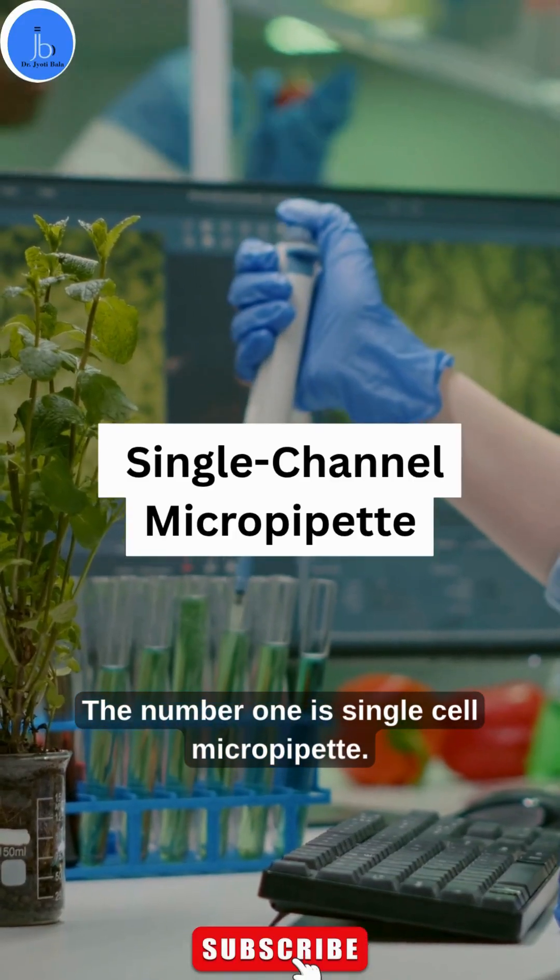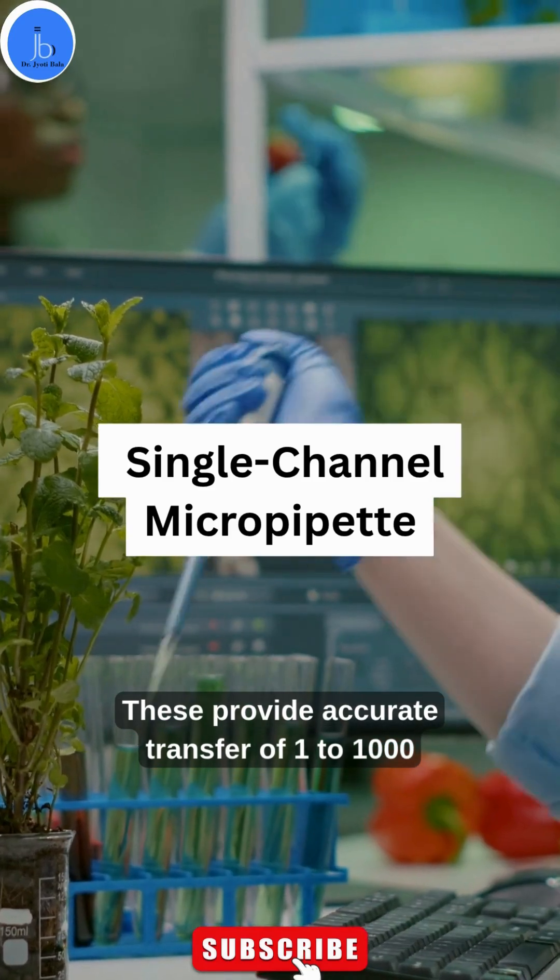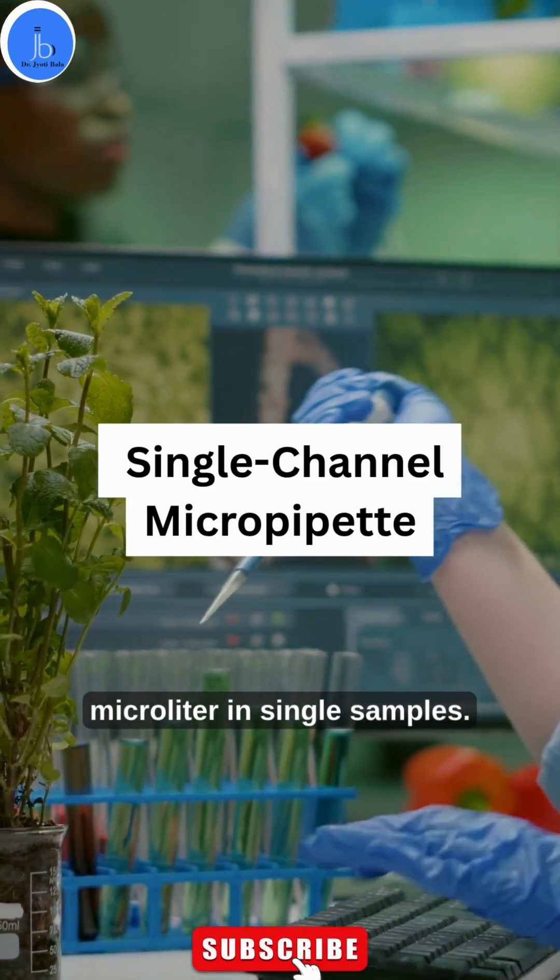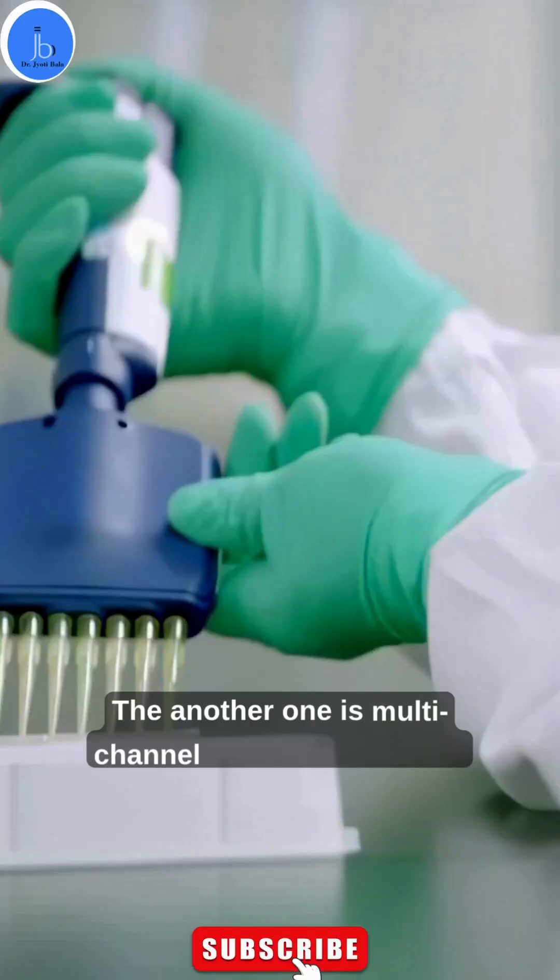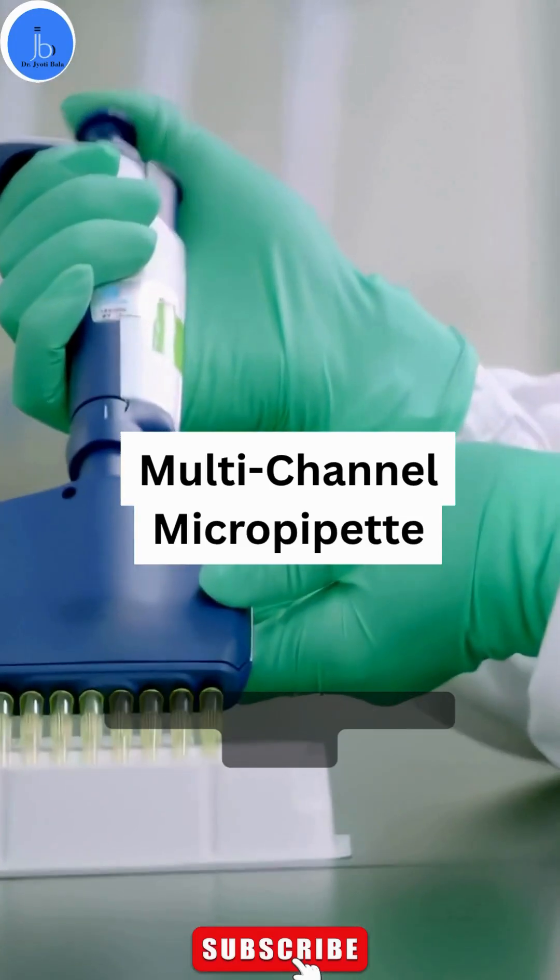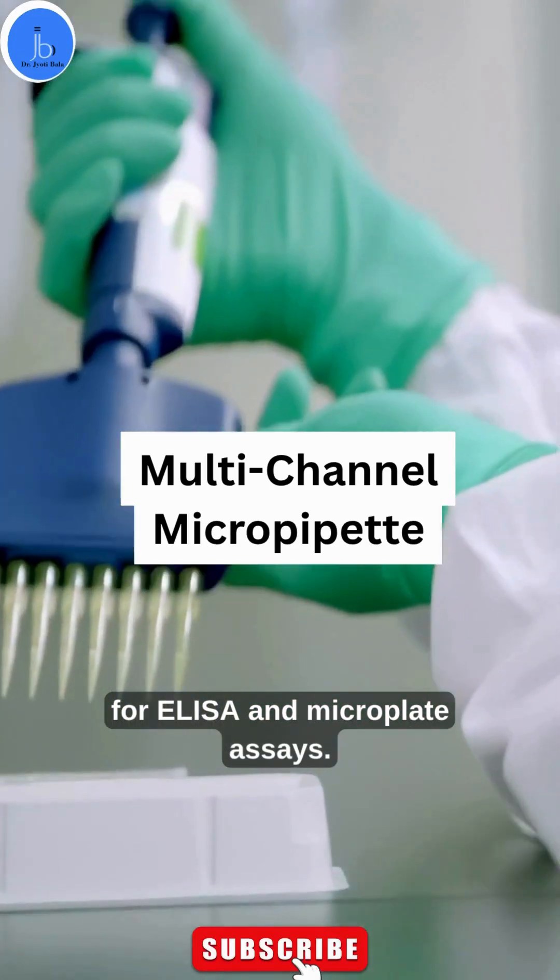Number one is the single-channel micropipette. These provide accurate transfer of 1 to 2000 microliters in single samples. Another type is multi-channel micropipettes, ideal for ELISA and microplate assays.